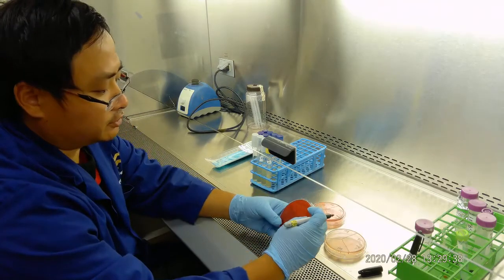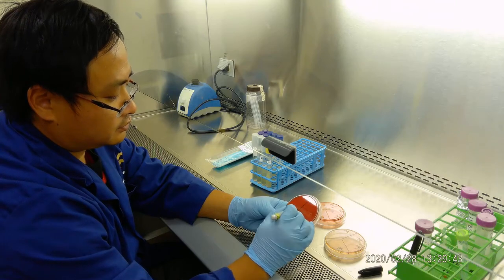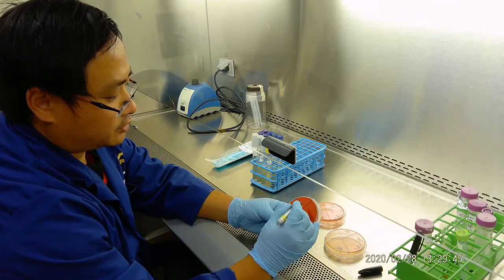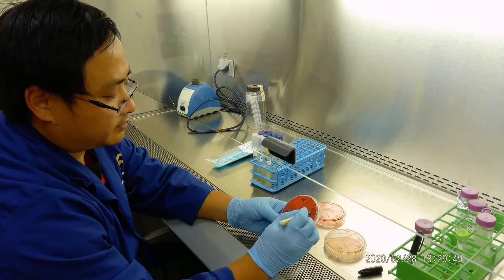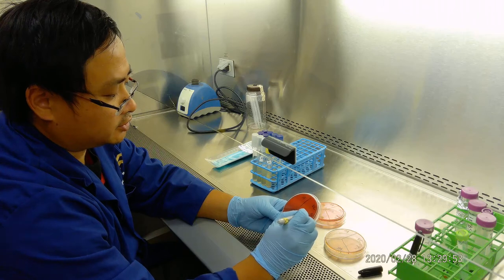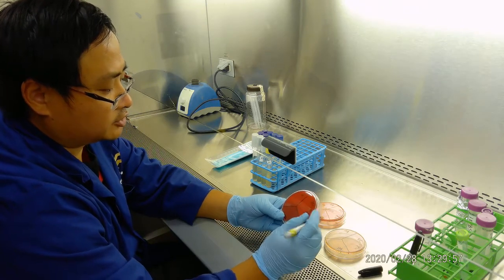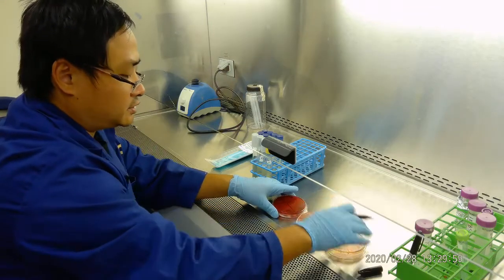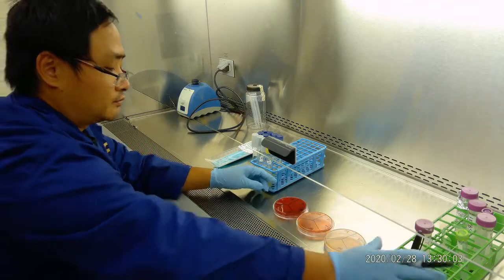This is the blood agar. We do the same thing. We split them into 3. So we have Staphylococcus aureus, E. coli, Pseudomonas aeruginosa. We're going to do initials, date, and bench number. Okay. After doing this, take a picture right now for the whole thing.